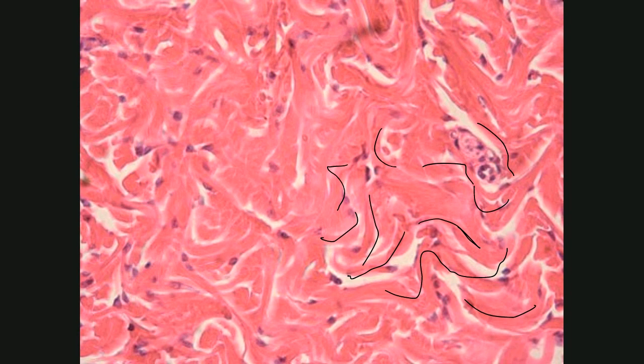And here again is another one. If you just follow these, look, that one goes like this, and that one goes like that, and this one goes this way, and that way, and this way. They're very irregular. But it's mostly collagen.